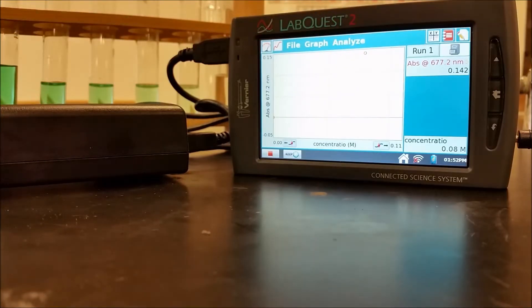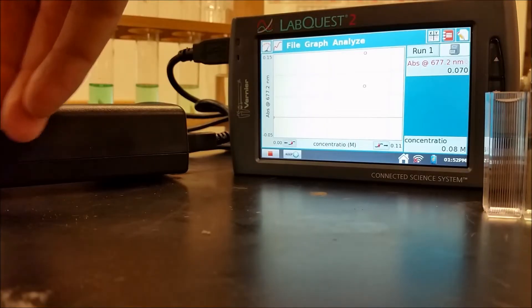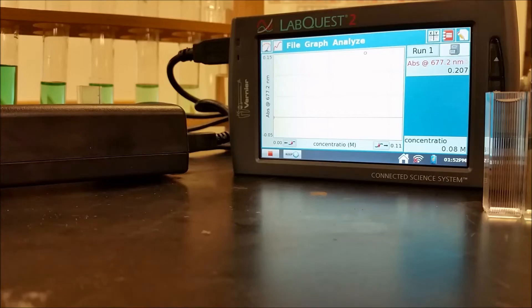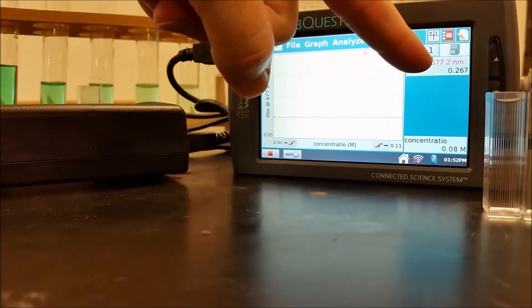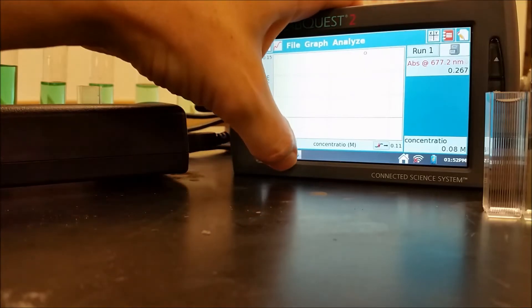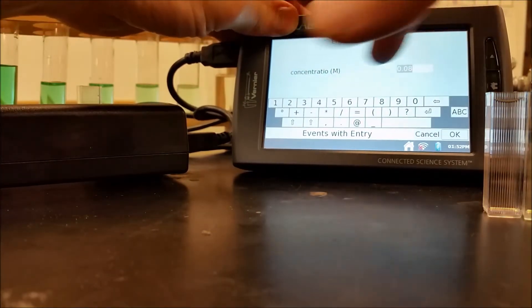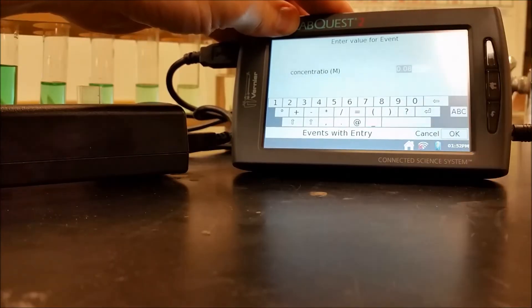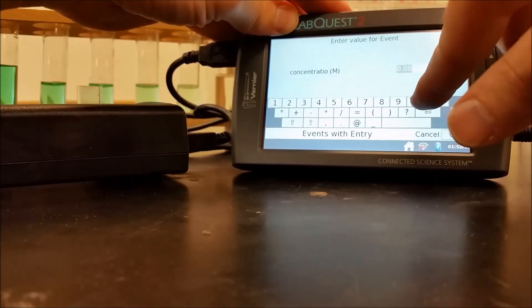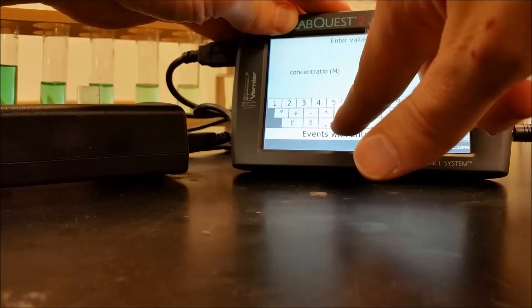So I'll take that out. Put my next one in. So each time I do this, my concentration should be going up. You want to give it a second to stabilize. And then once it does, you can go ahead and keep. And then each time we're going to type in what our next value is, 0.16.